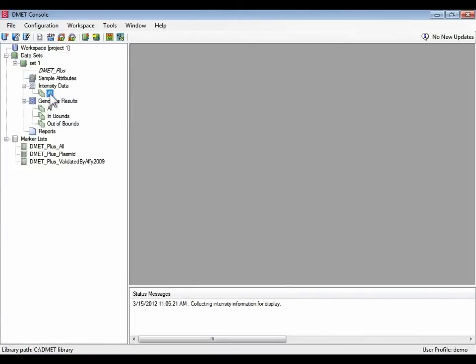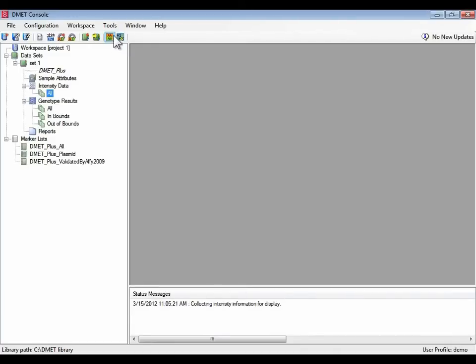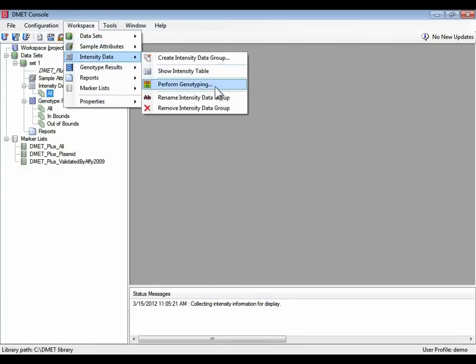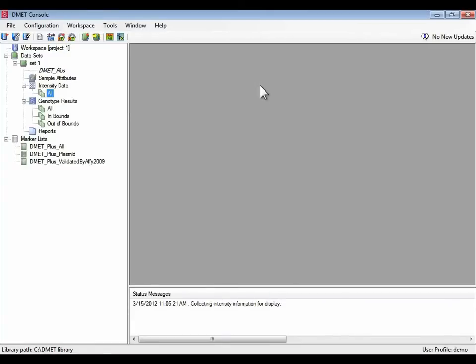If you forget where these commands are, you can also get it from the toolbar perform genotyping, in which case you may be asked which group of intensity files you want to genotype, or you can get it from intensity data perform genotyping. So let's proceed with some genotyping.